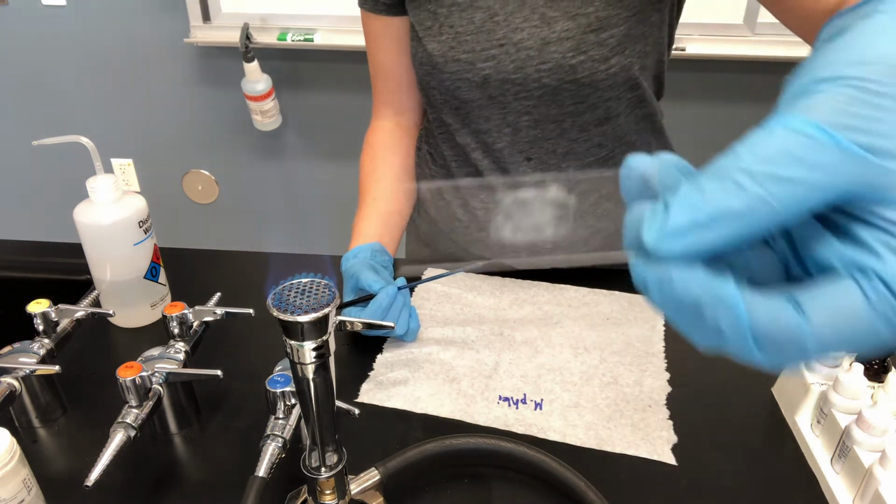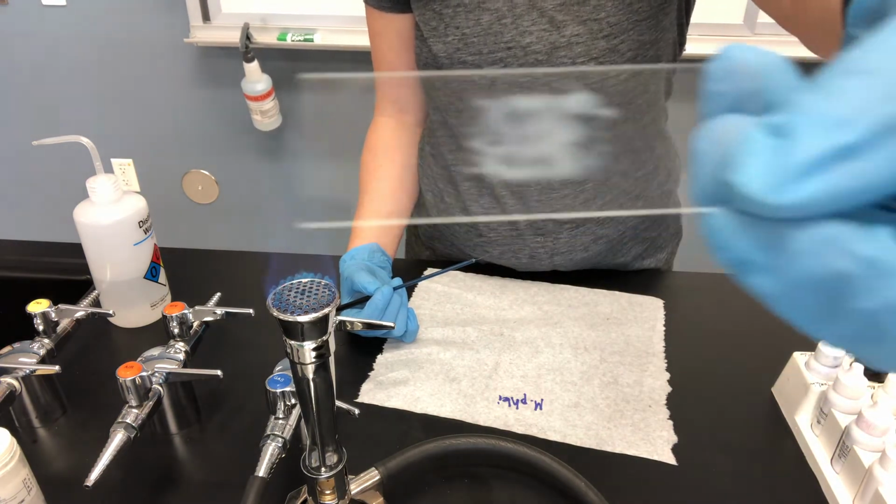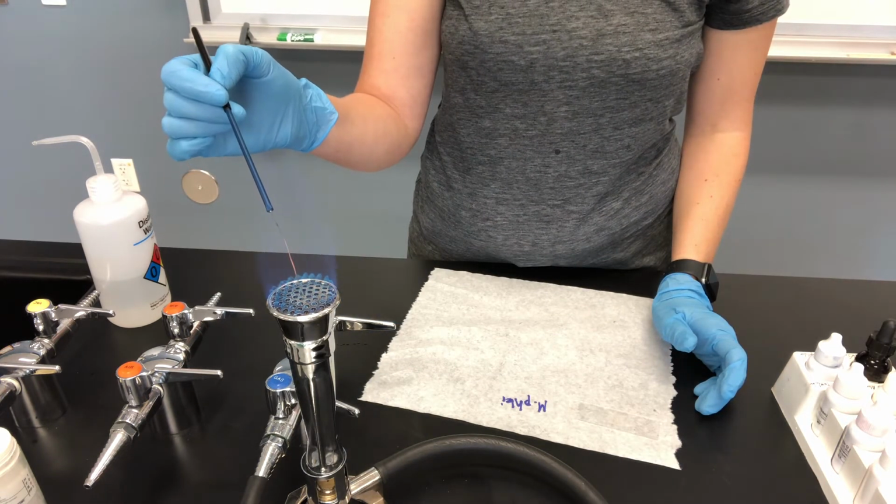Right, so that's a little bit better. You can see that smear better. Nice and cloudy, you can see it's there. So then I'll flame my loop, and then we have to wait for that to air dry.